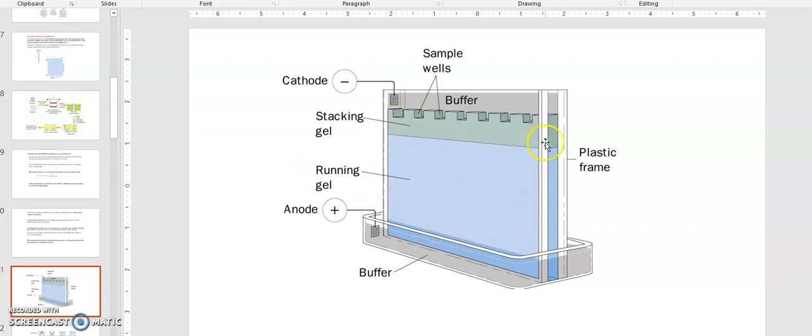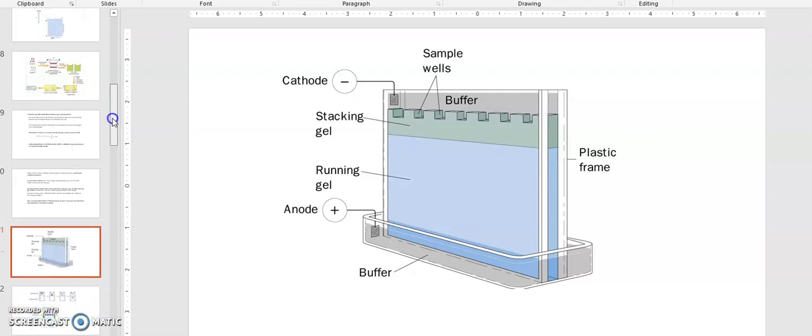So by having a little bit of this low percentage gel, you're going to have your proteins migrate through your gel more easily. Since this may be made up with only 3% acrylamide instead of maybe 12 or 10%, your proteins are well separated first here through the stacking gel, and then they will be separated further on your resolving gel. So it gives a better migration of your protein samples into the gel. That's the whole purpose of having the stacking gel. But these days, you rather use a continuous gel that is gradient formation. So we'll talk about that.